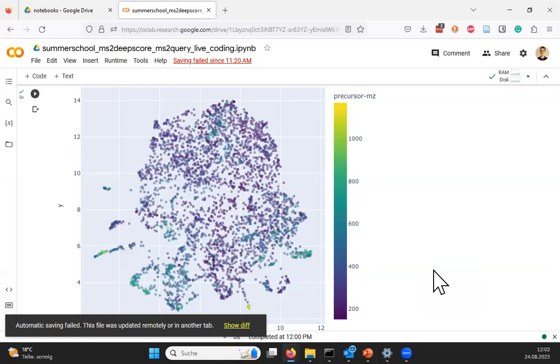Because you might see things that you will not immediately see in a network plot. For example, that there are some weird groups that are apparently very different from the rest of the compounds. I have to do amateur speculation here, but you can say maybe these are traces that don't belong there, or maybe this is a group of things that were added, or maybe it's something I'm looking for. And that's exactly what I hope eventually you could get out of these plots.